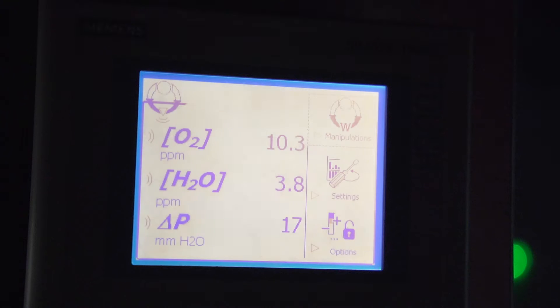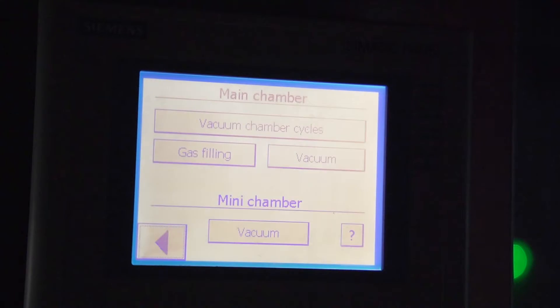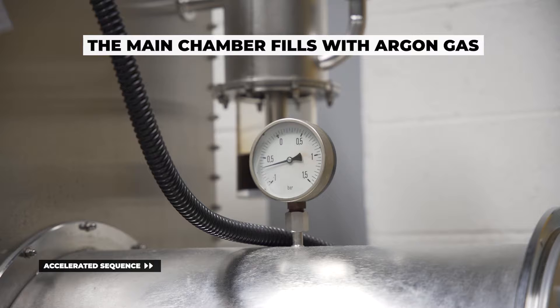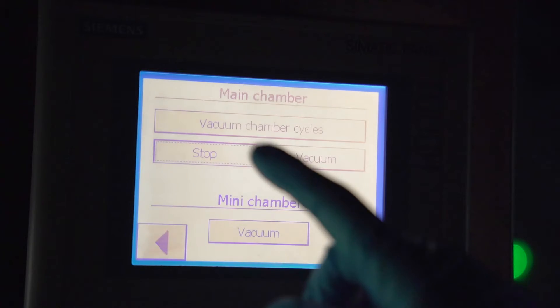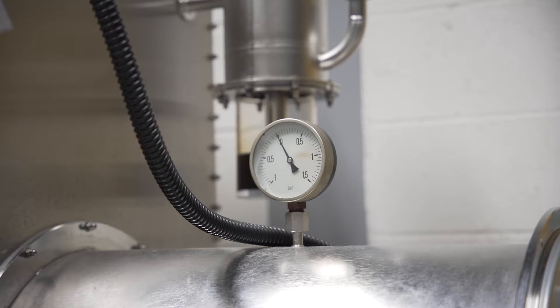By default, the chamber is under vacuum. You need to fill it up and return to atmospheric pressure — zero on the needle pressure gauge — before opening the outer door. Use the panel screen to trigger the pump: press the manipulations section, then vacuum chambers, then gas filling. Press stop when atmospheric pressure is reached, with the pressure gauge needle at zero.